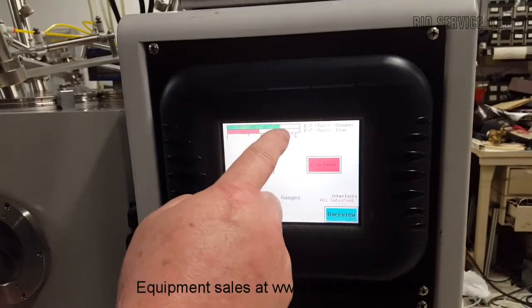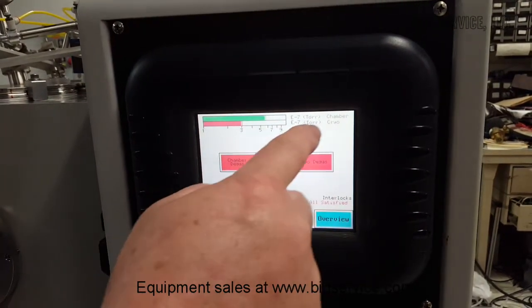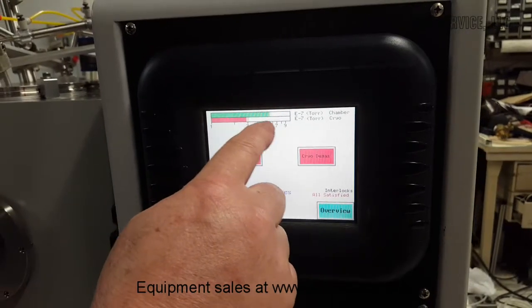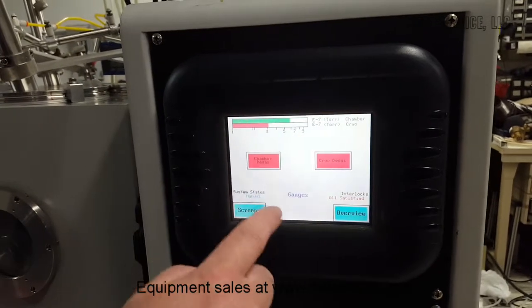Then you've got your gauges and you can see what it's reading. The one on the bottom is your cryo, the top one is your chamber. I'm in the three range in the negative seven in the cryo, and around five to six in the negative seven in the chamber.